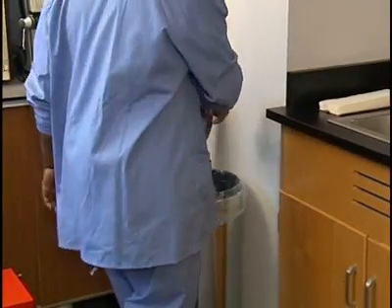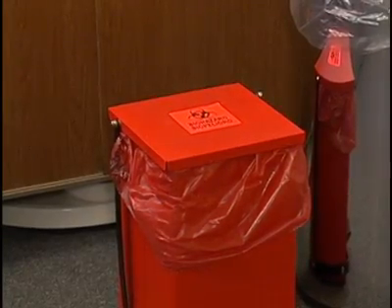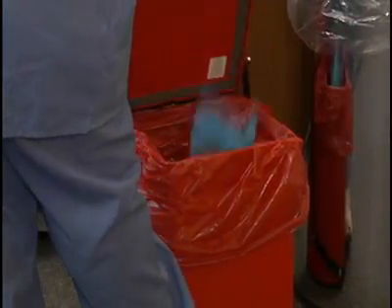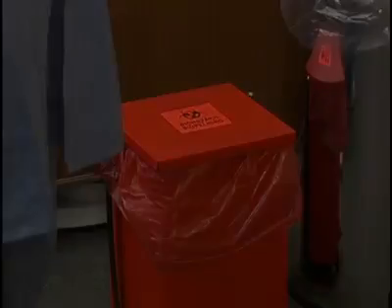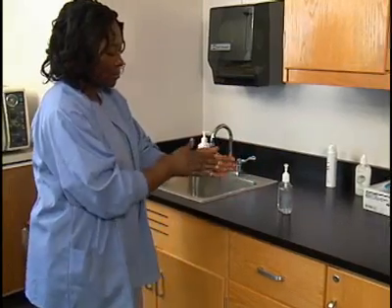Discard both gloves into an appropriate container. If your gloves are visibly contaminated with blood or other potentially infectious materials, they must be discarded in a biohazard waste container. Otherwise, you can discard them in a regular waste container. Sanitize your hands to remove any microorganisms.